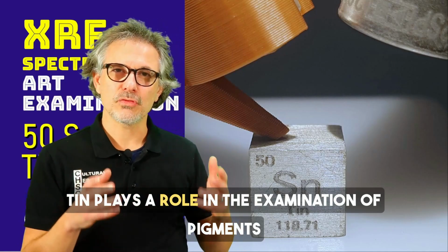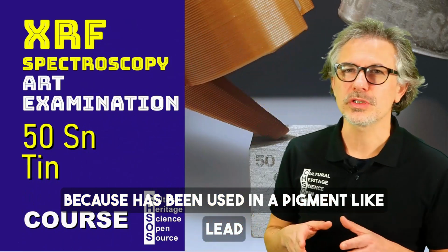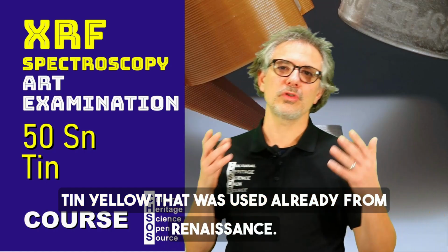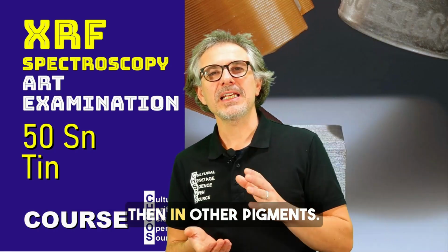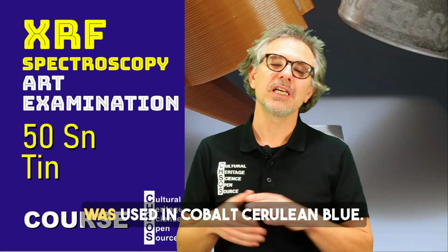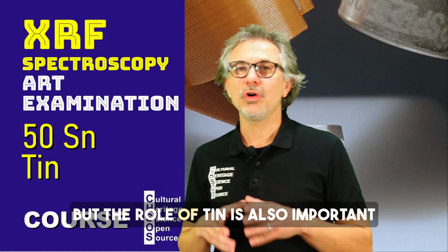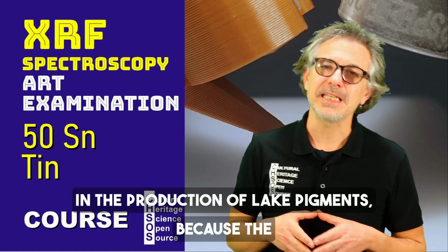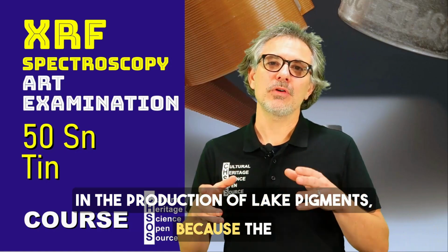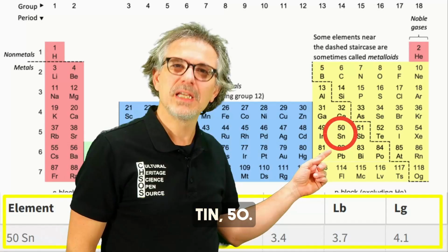Tin plays a role in the examination of pigments because it has been used in a pigment like lead tin yellow that was used already from the Renaissance. Then in other pigments, for example in modern art, it was used in cobalt cerulean blue. But the role of tin is also important in the production of lake pigments, because tin salts are often used as mordant.